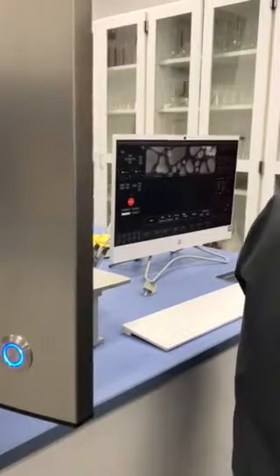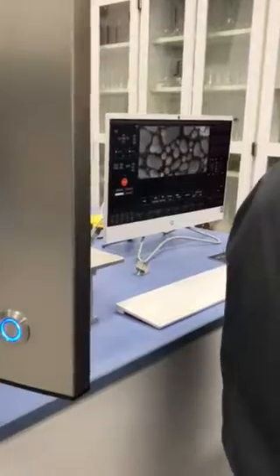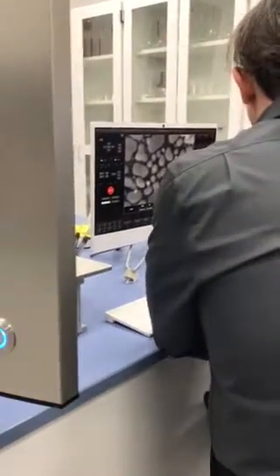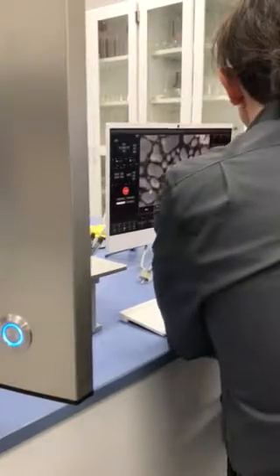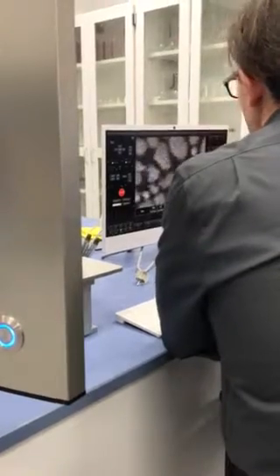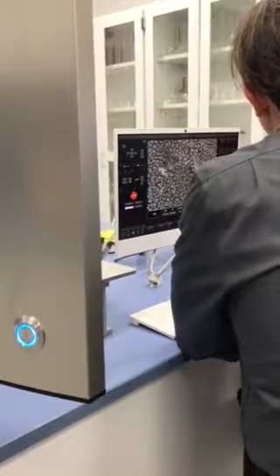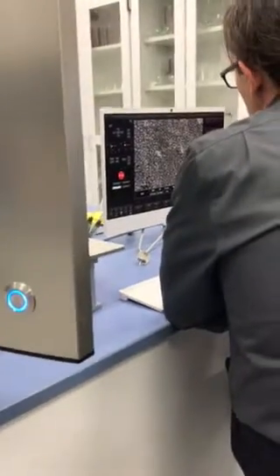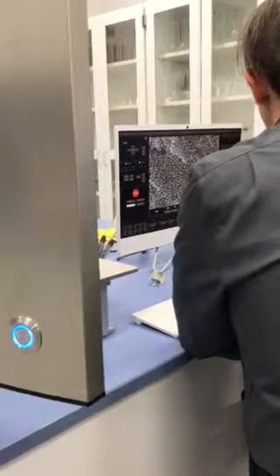What is the surface requirement for this? What is the surface finish for testing? Just your bench? Yeah, just your bench. So at 99,000x, if I was to take a ruler and measure spatial resolution, we're talking 19 nanometers. And I could just continuously zoom in. Wherever I left-click, it centers the stage to that point — it's a motorized stage. Left-click and it centers that part.